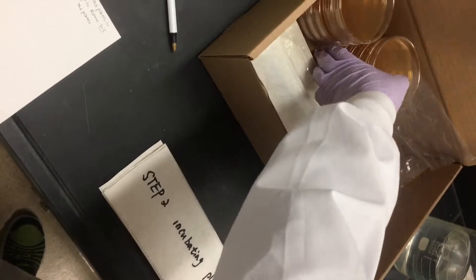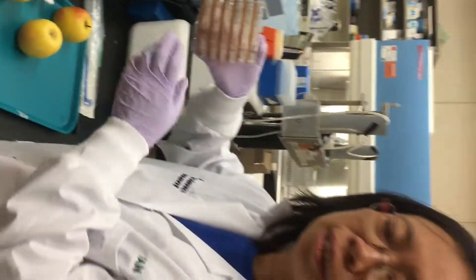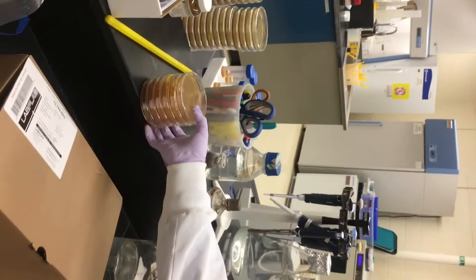Step 2: Incubating the plates. Take the plates and put them in the incubator at 30 degrees. Or you can put them at room temperature for these 3 days.